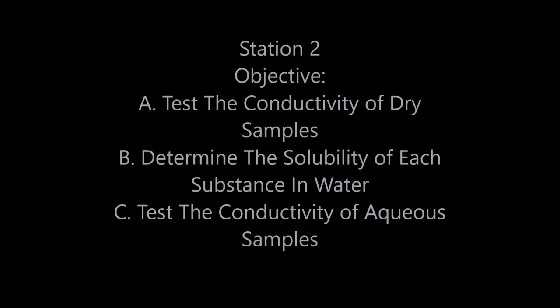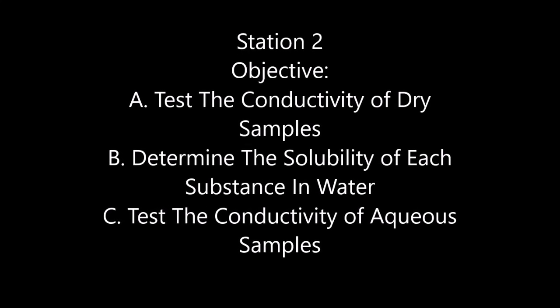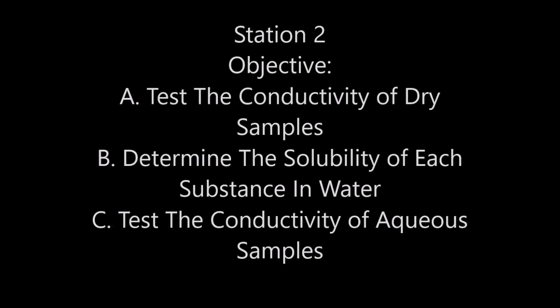Station 2 possesses three different objectives: testing the conductivity of dry samples of the solid, determining the solubility of each substance in water, and testing the conductivity of aqueous samples.